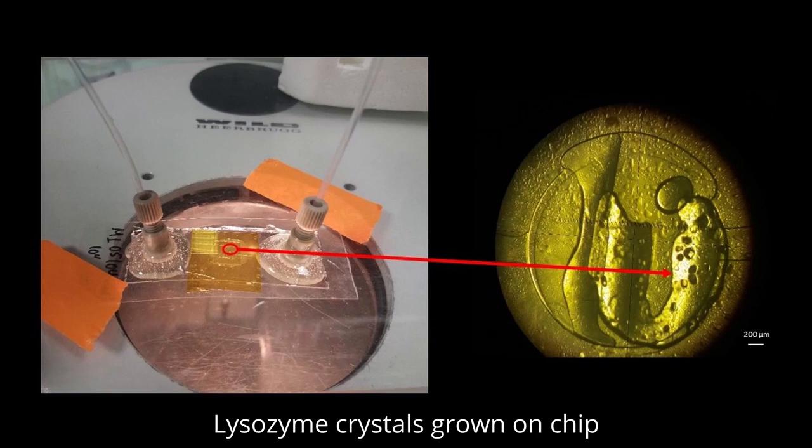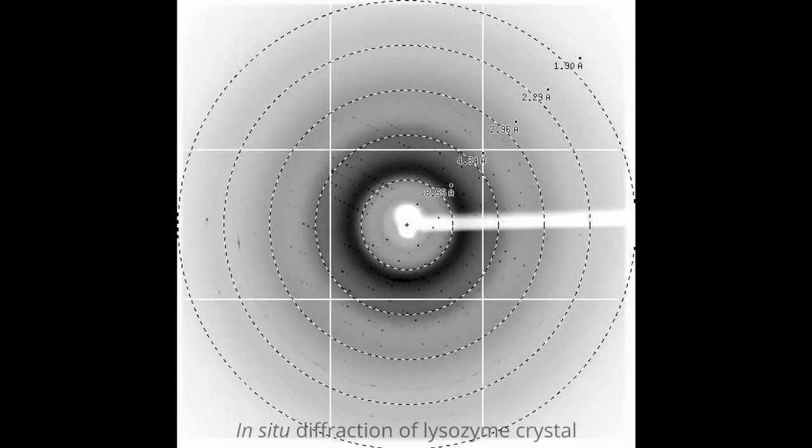Moreover, our microchips use microdialysis for protein crystallization, which is a diffusion-based method aiming to equilibrate the precipitate concentration through a semi-permeable membrane in order to approach the optimal concentration for protein crystallization.